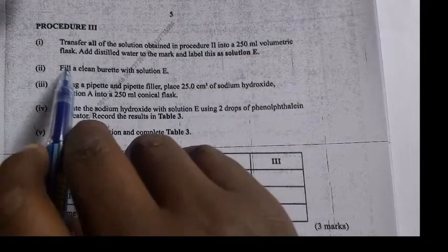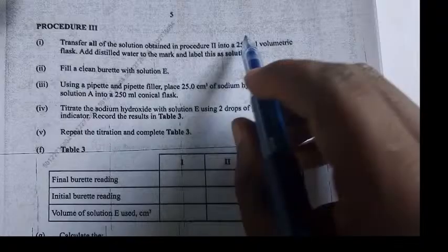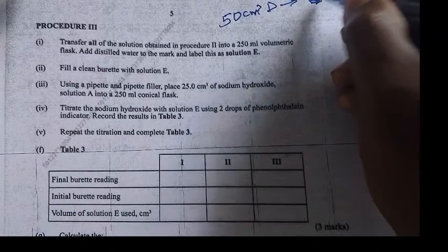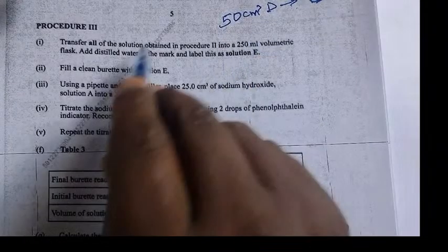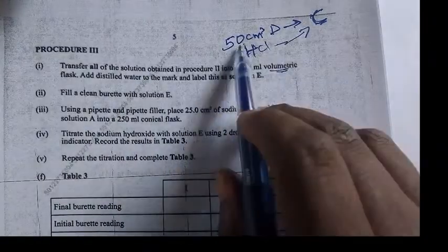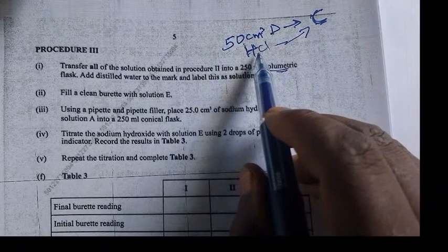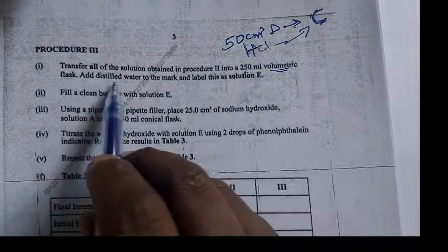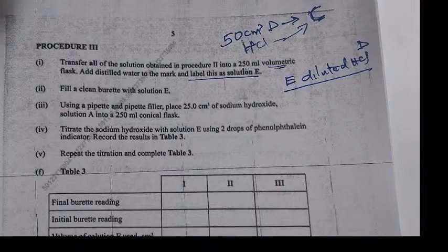Transfer all the solution obtained in procedure 2. Now remember the solution we have left here, we had 50, we have done it. Now the solution, we are transferring it into the volumetric flask. So the D, which reacted with solid C, right? Add distilled water to the mark and label that solution E. Remember that.